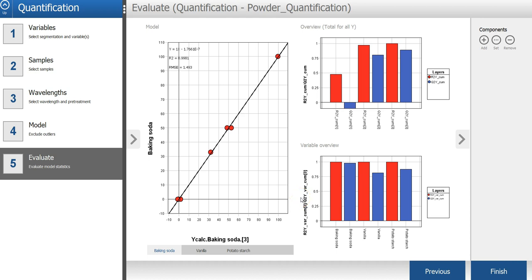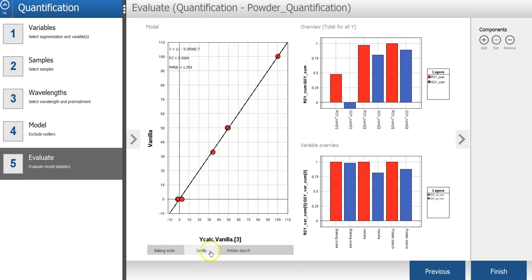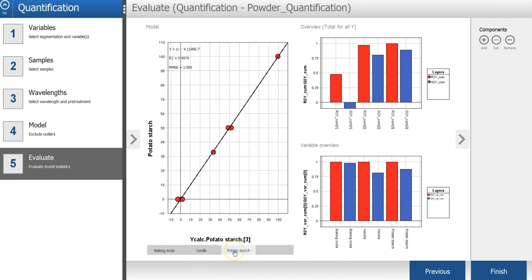In the last step of the wizard, you can evaluate how good the model is. The Y-versus-Y-calc plot is showing how well the model can explain the variation for each of the Y variables.